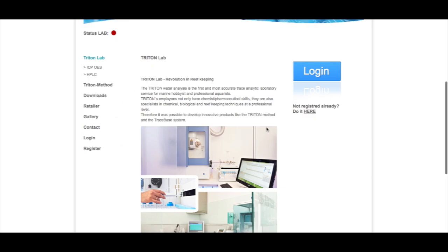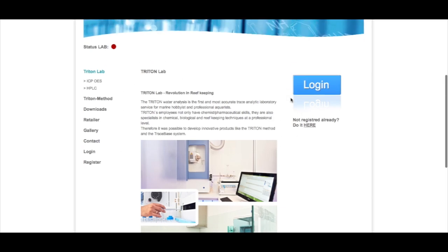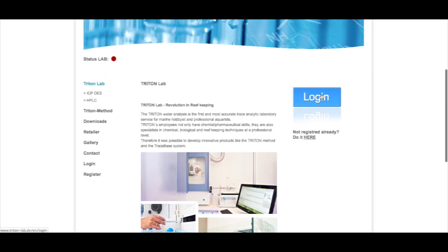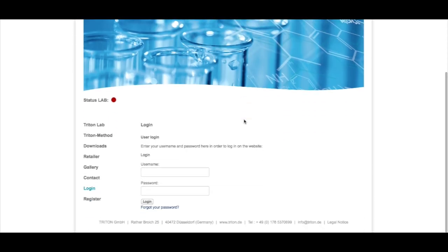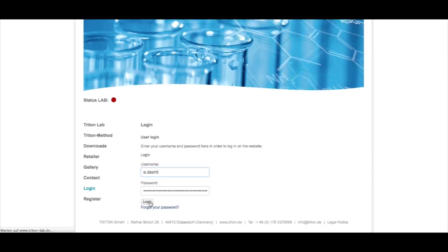I don't think I need to explain the register stuff, this is quite self-explaining so we go directly to login and type in username and password and login.